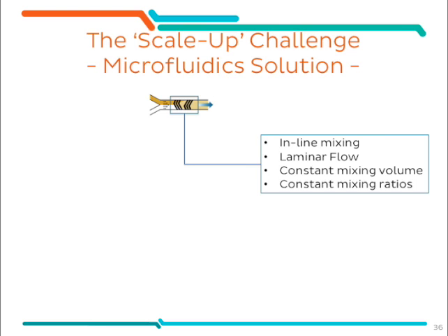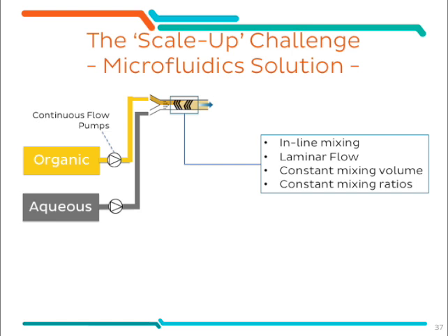This is the case when I want to formulate a small volume. So in this microfluidic channel, I could inject small volumes with a syringe into the mixers, and that's what we do with the NanoAssembler benchtop instrument. But I can also feed larger volumes into this device by using continuous flow pumps, actually, in this case, we have 2.